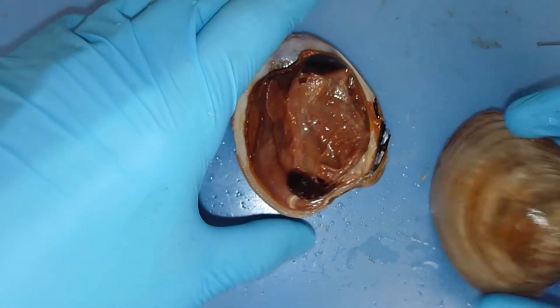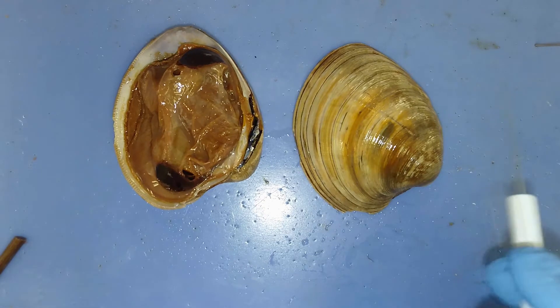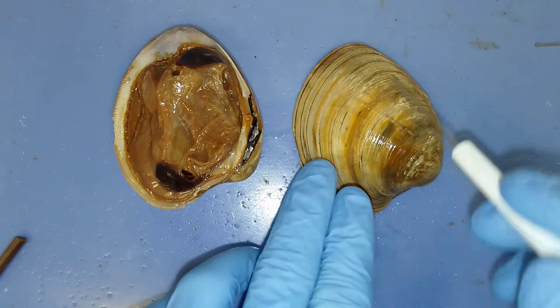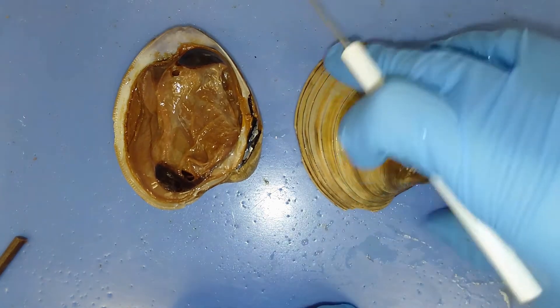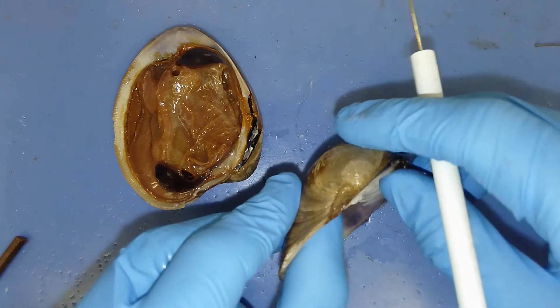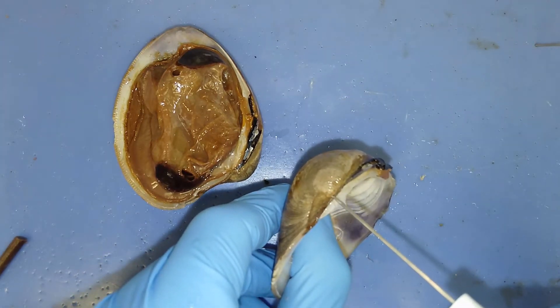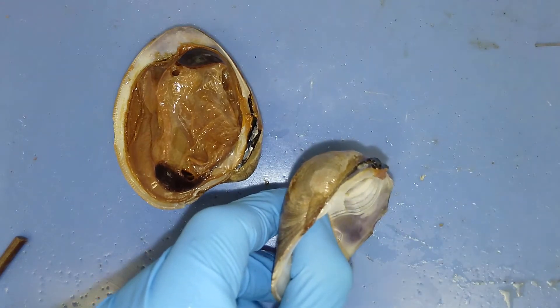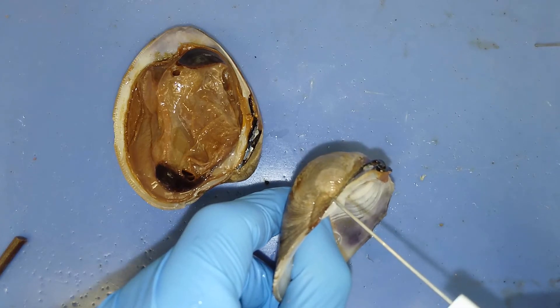If we take a closer look at the shells, each one of these lines is a growth ring. These growth rings show how the mantle was excreting calcium carbonate over time. If you look all the way back to the hinge, you can see how small this individual was when it first started laying down calcium carbonate and began its shell after its glochidia larval stage.